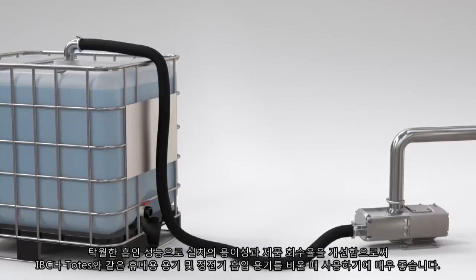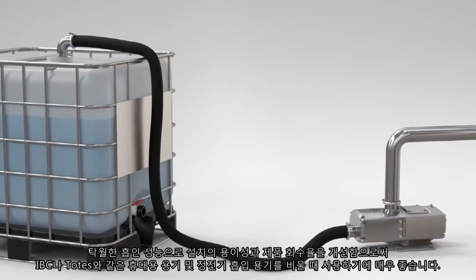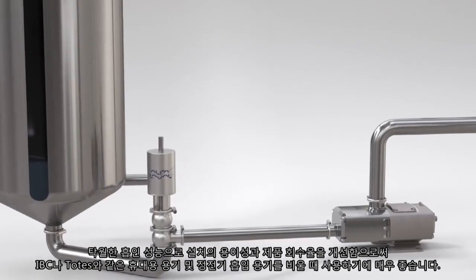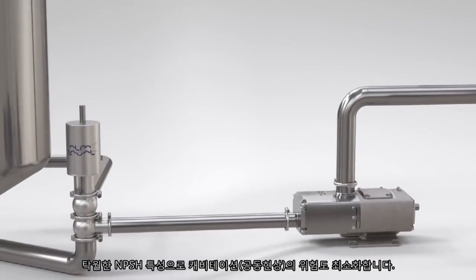Superior suction performance provides installation flexibility and increased product recovery, making it ideal for emptying both portable containers like IBCs or totes, as well as static suction vessels. An excellent NPSH characteristic minimizes the risk of cavitation.